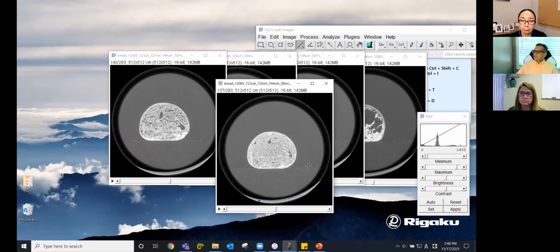Now, I have 5 scans. Sometimes you might have 10, 20, 30 scans to deal with. If you're going to change the voxel size and crop it, you probably want to find a good, easy way to repeat that on 5, 10, 20, 30 scans. So that is the next polling question.